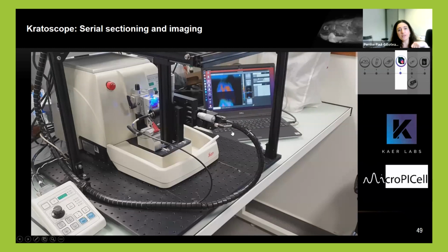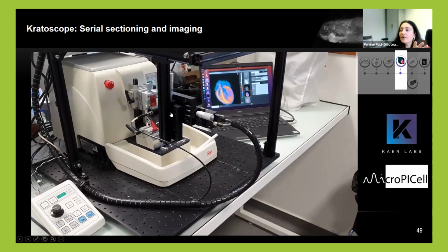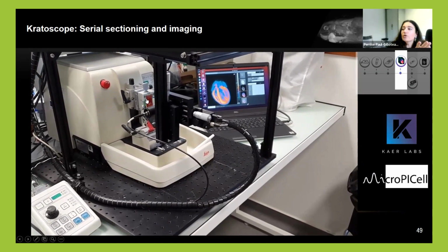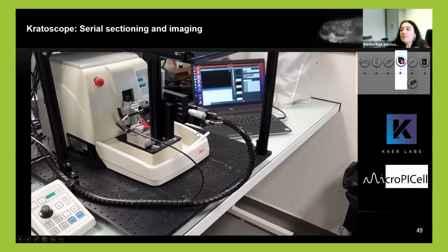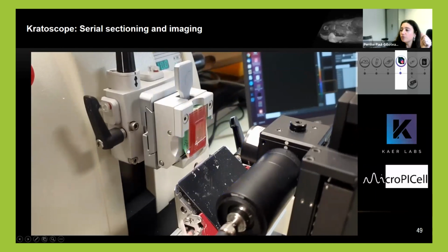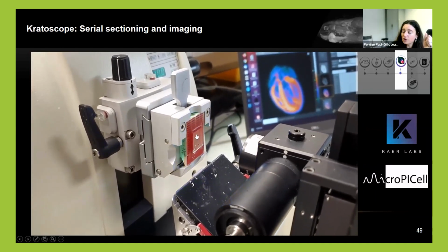imaging, like infrared imaging. So they modified the system then for us, just as it is done already in some CLEM projects, but we image the sample whilst at the same time it is cut, and make it an imaging modality by itself. So this is a microtome which cuts the slice when you want to do, for example, histological data.